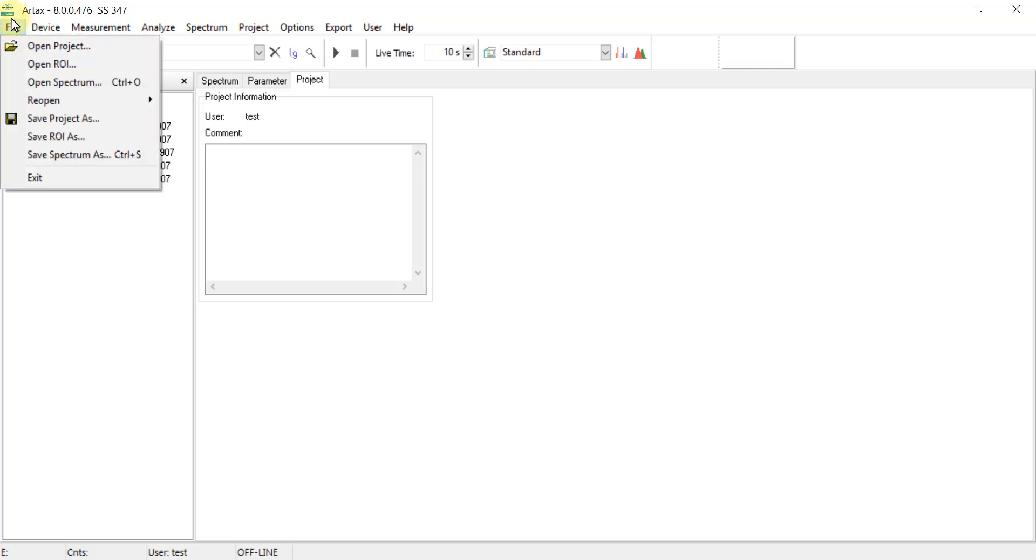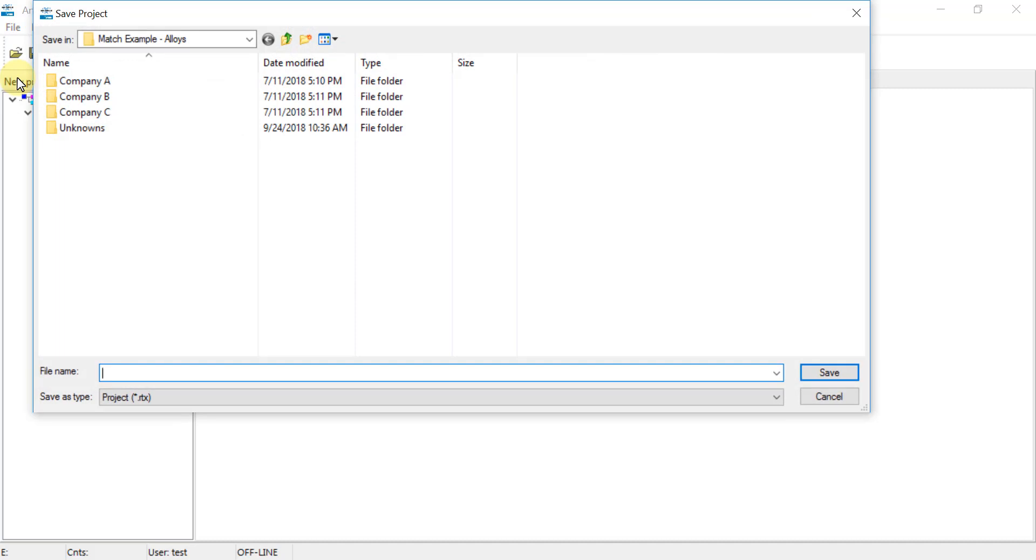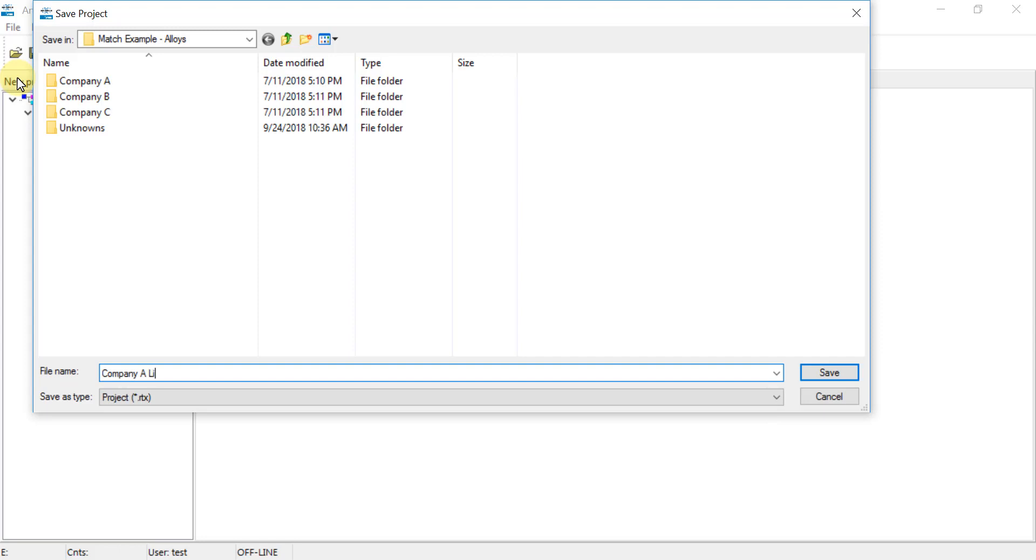From here, we go back to File, Save Project As, and we will give this library a name, and then it will store this as a .rtx file, which will be the library for this particular set of PDZ files. Hit save, and now that library is stored.